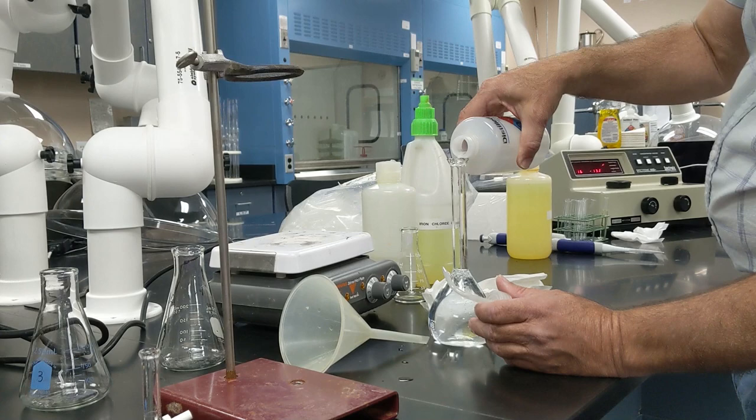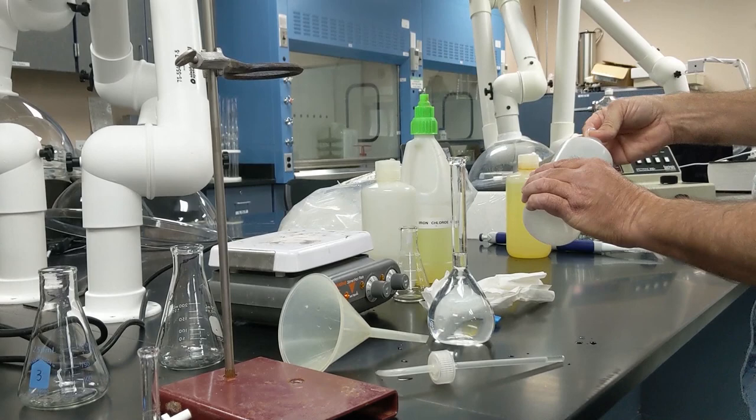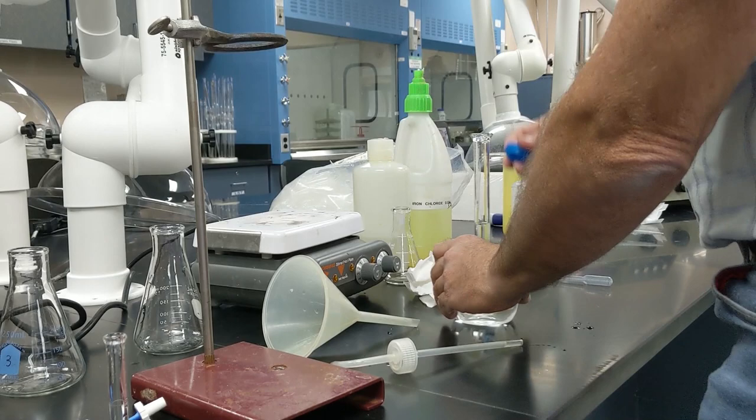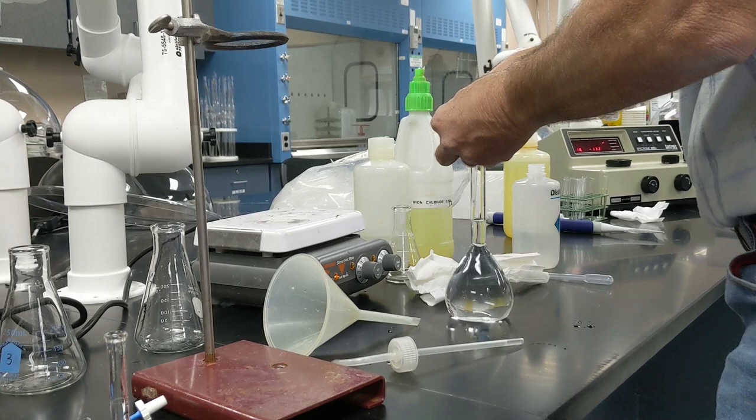And then I'll use a disposable pipette to get this right there. Okay, so I've filled it to the 250 ml mark, and the next thing I'm going to do is mix it up to homogenize it.